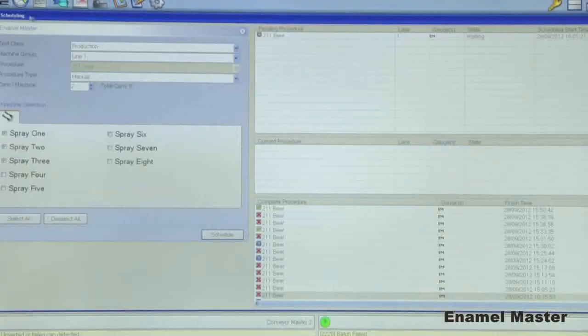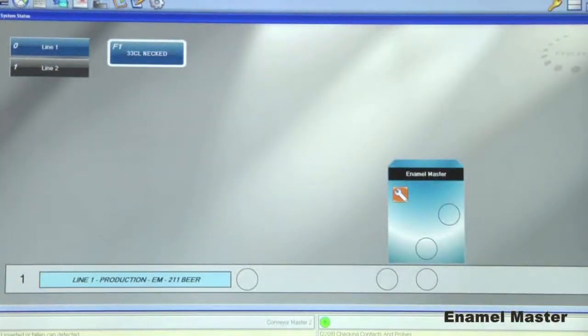Like all Master Series modules, Enamel Master tests are set up via the single control screen, using Sencon's Process Master software.